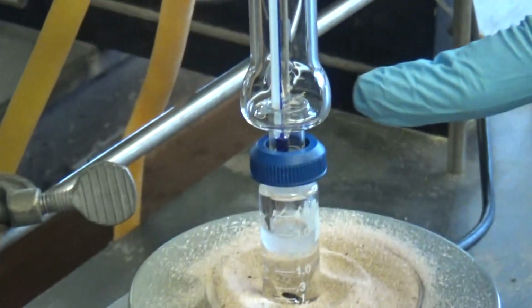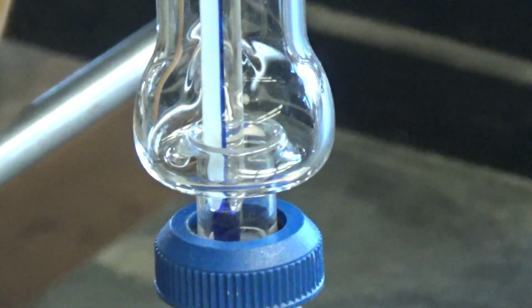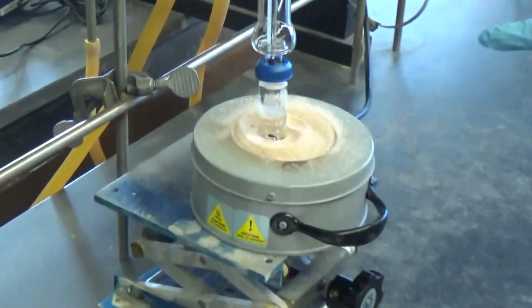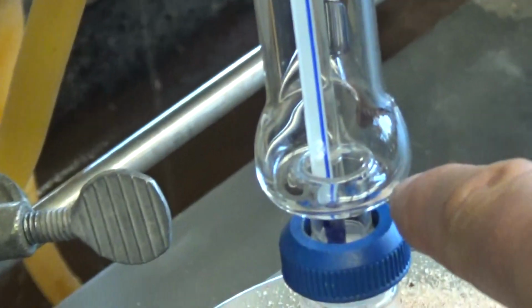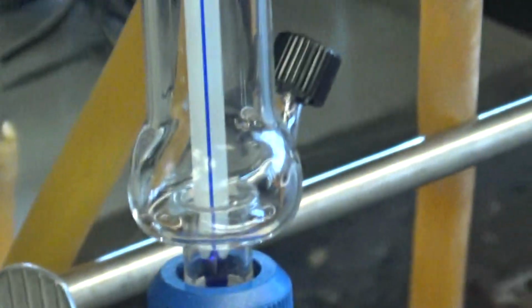Now we just wait. We are going to collect liquid here, and we'll be transferring that. We need 1 milliliter. That will be the product and water. Because we have H2SO4, it will cause a reaction, and then the product will boil up and be captured in that little bulby area. Along with water, you need a Hickman head with a side port. With the side port, you can pull it out with a pipette or a syringe. Very nice. All right, that makes sense.